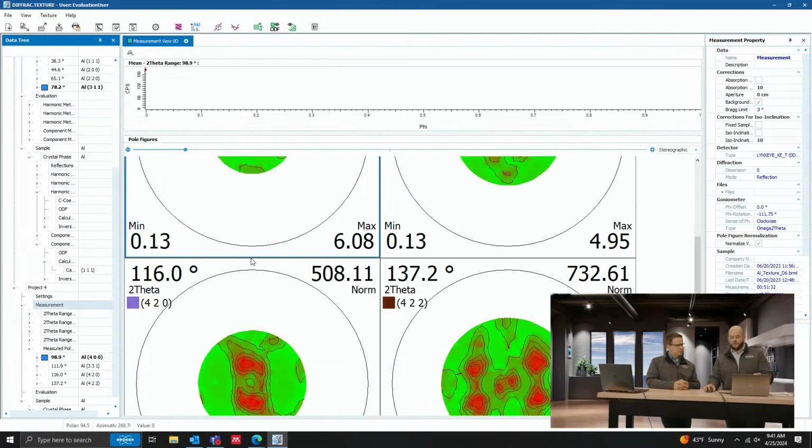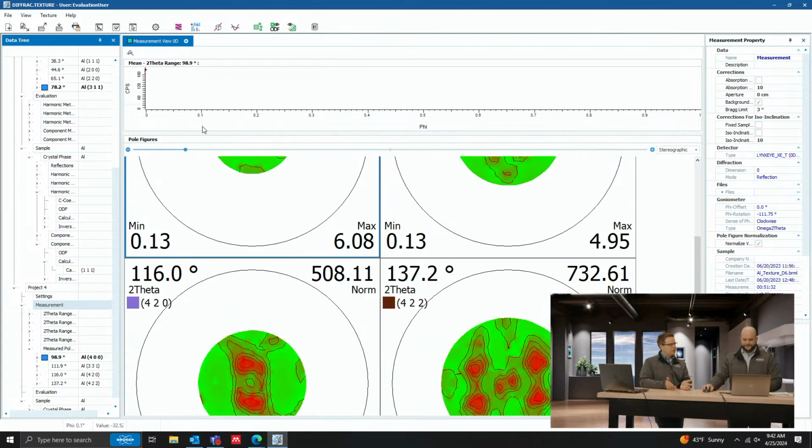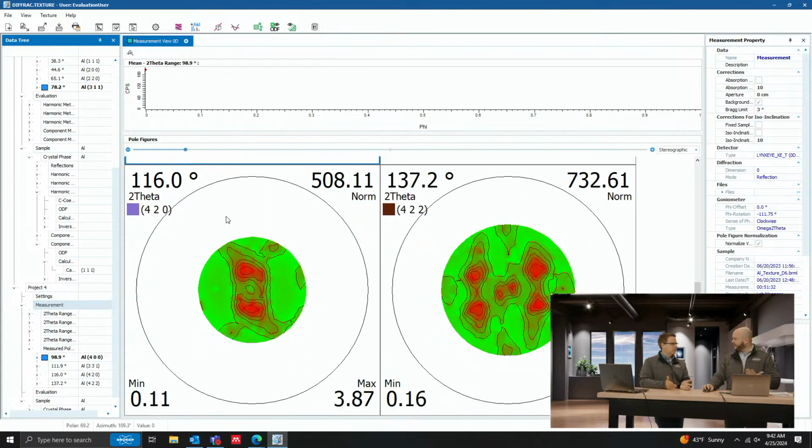You can see these are higher order reflections because then I can get my source and detector close together and I get more coverage effectively. And a common thing might be, they look at this versus your other pole figure. And somebody goes, you can't do it. We don't have coverage of the pole figure. But that doesn't really matter if you take more than one pole figure, right? Right, exactly. So you make up for that by taking multiple pole figures.